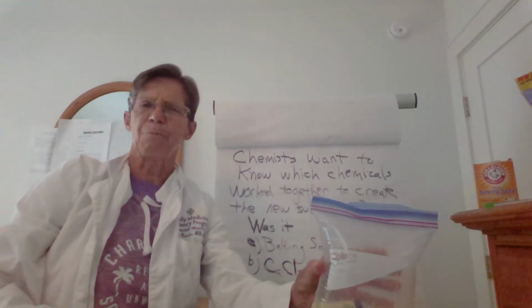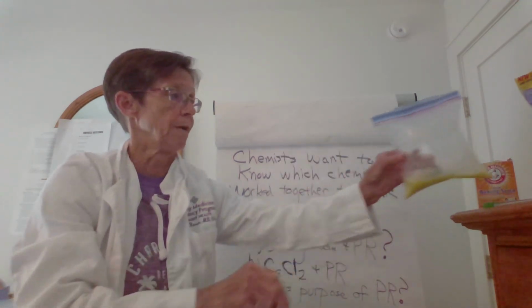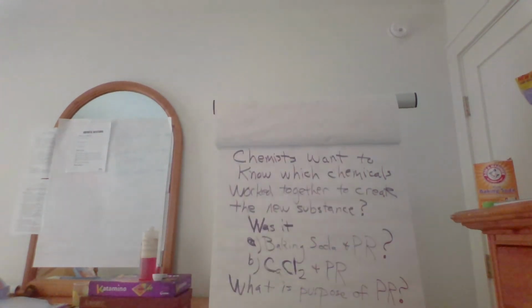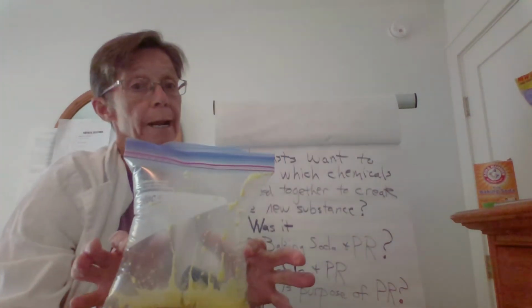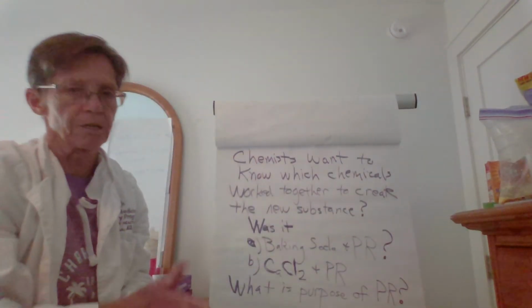I've done this lab a ton of times. I have never seen a bag pop yet, but that would be cool, all right? So our next set of questions is this. See? Didn't break, didn't pop, right? We'll set it up there for a minute. All right, here's our next set of questions.